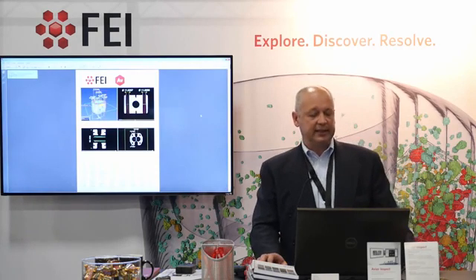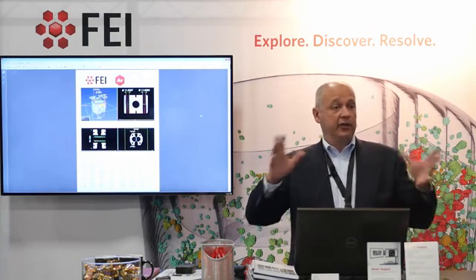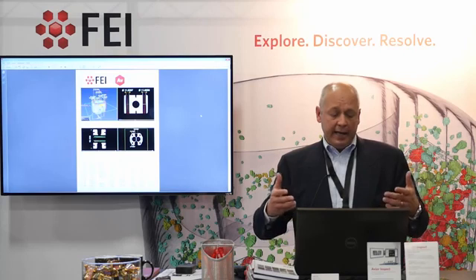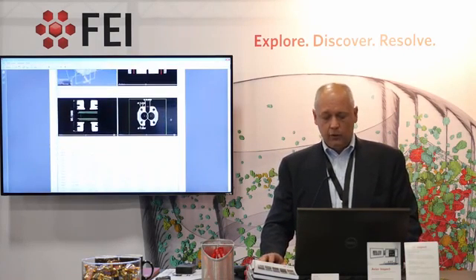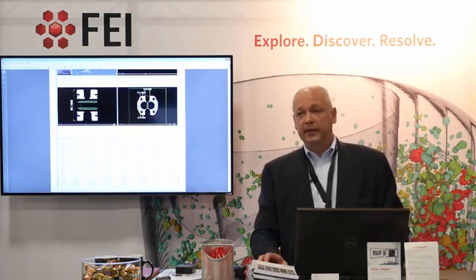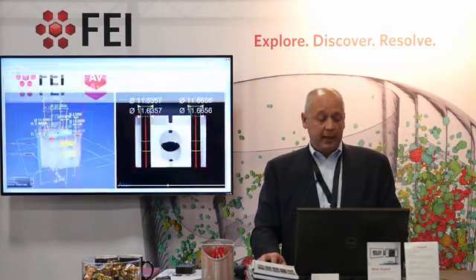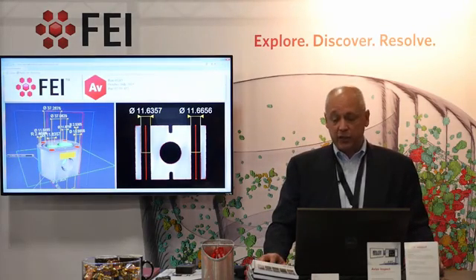So I'm just loading. This is an example of a report that has been generated by Avizo Inspect, where you can define a template where you have frames, you can have static information inside, such as your logo, for instance, the date, number of run, and then you can associate snapshots. And then we have also, if I zoom in, some result of analysis there that can be shown inside this report. So this is an example of the PDF page that has been generated. Same example, it can be an HTML page. So we are producing HTML or PDF from the result of the inspection.